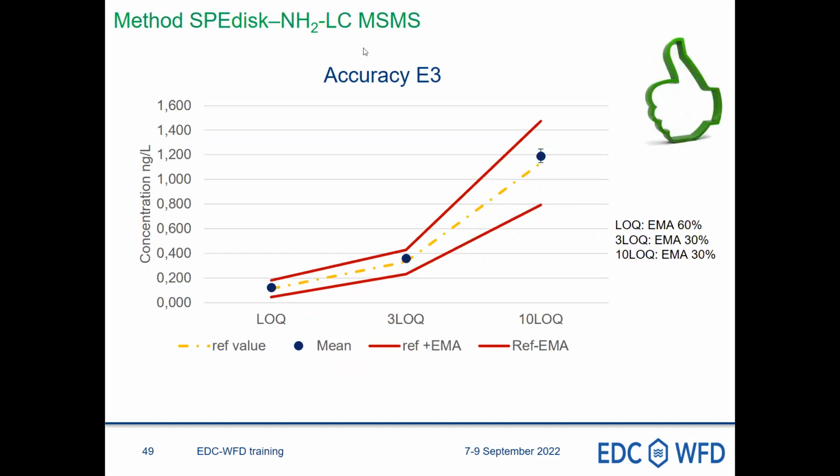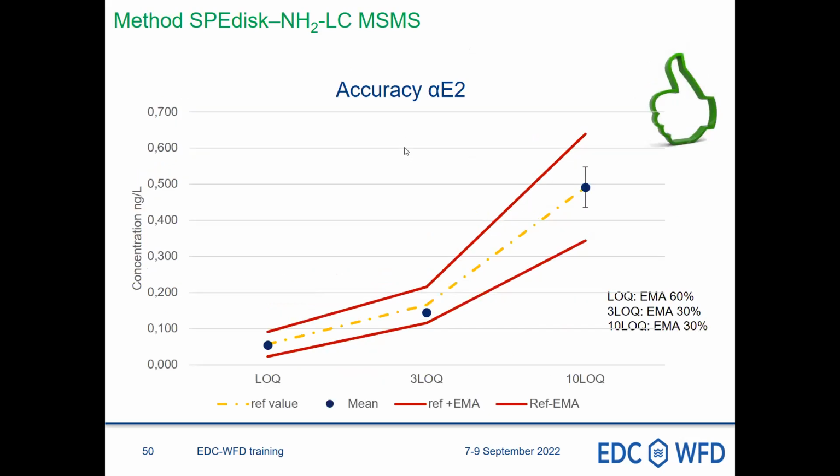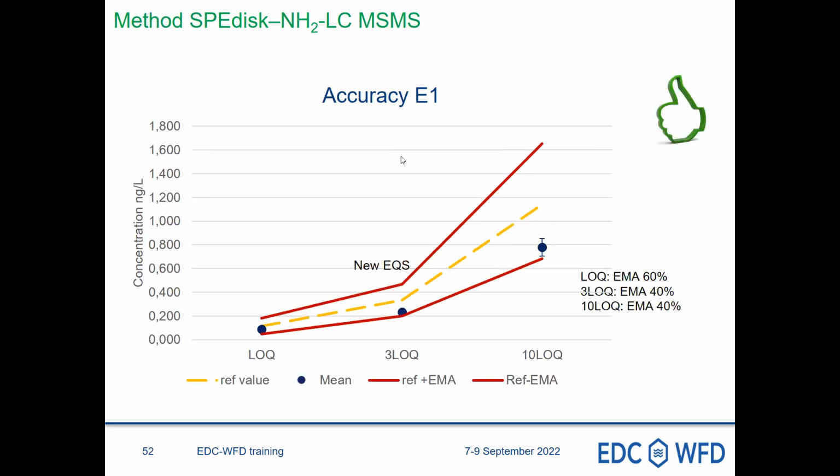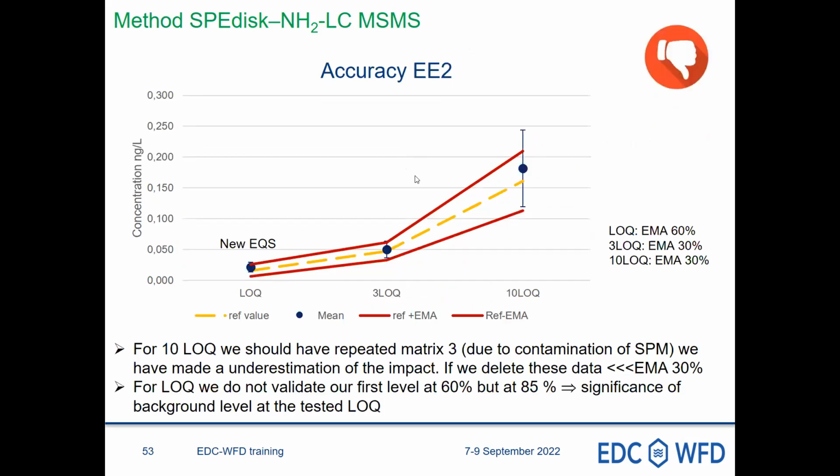So we switch to another method based on SPDISC, NH2 purification, LC-MS. Once again, still the same picture. It's okay for estriol. It's okay for alpha estradiol. It's okay for beta estradiol. It's okay for estrone. Problem. It's not so okay for ethinyl estradiol.